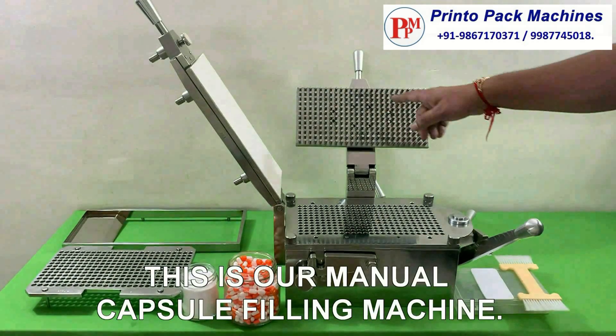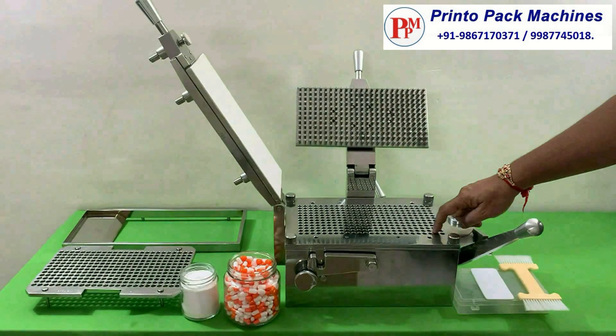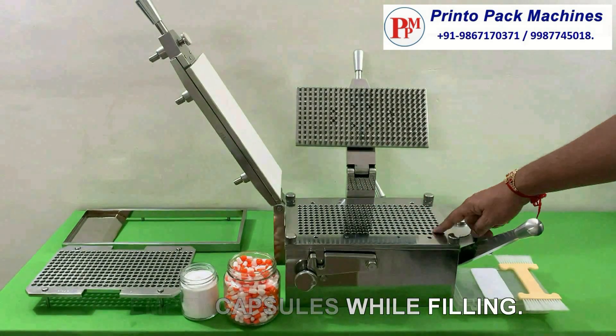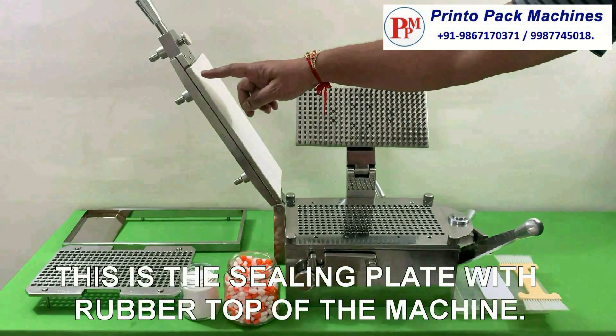This is our manual capsule filling machine. This is the capsule base bed which holds the empty capsules while filling. This is the sealing plate of the machine with rubber top.